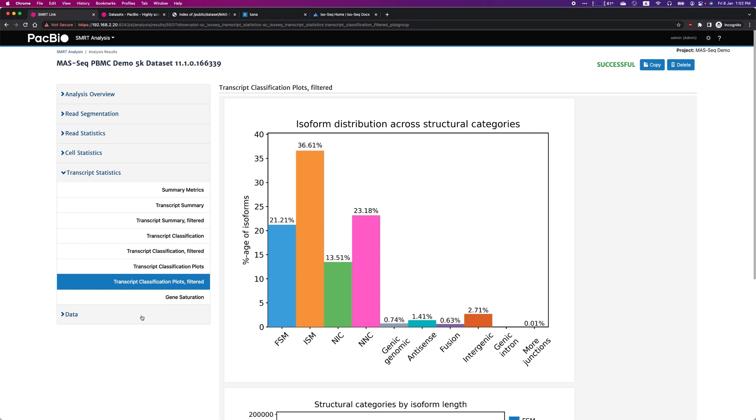In the Downloads tab, you will find many useful files that can be used for further downstream analysis.